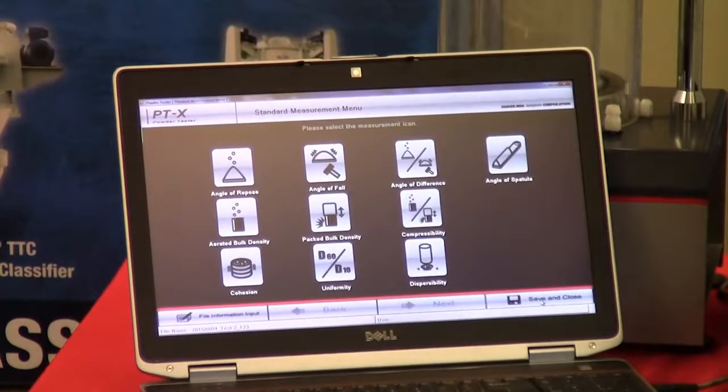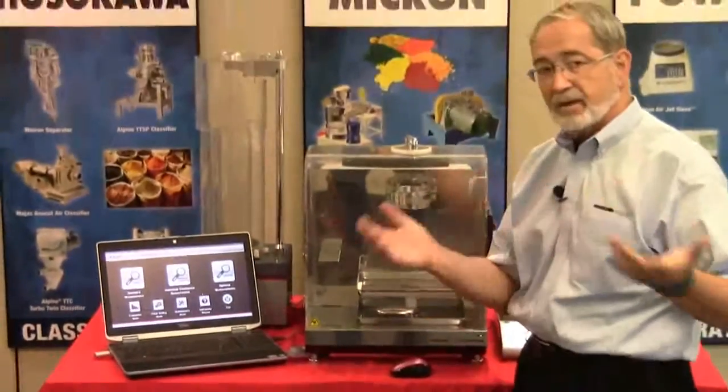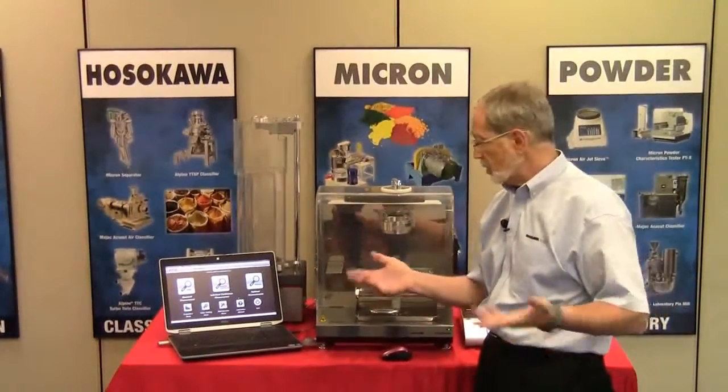And then you can just save and close, and notice that we already had that. We identified the test name, and we closed it out.